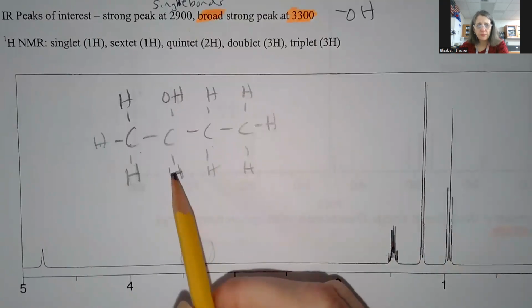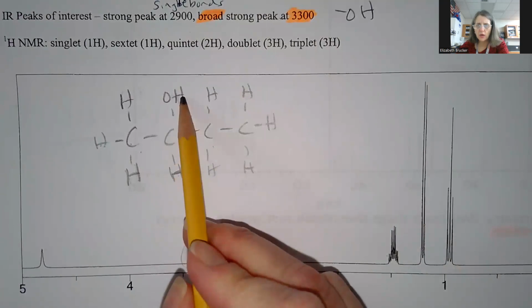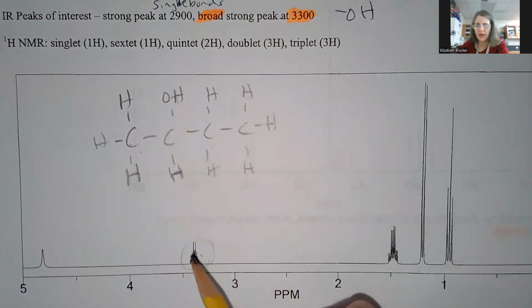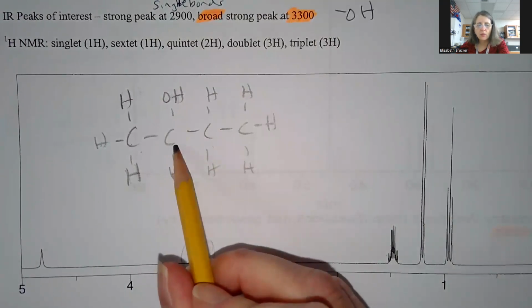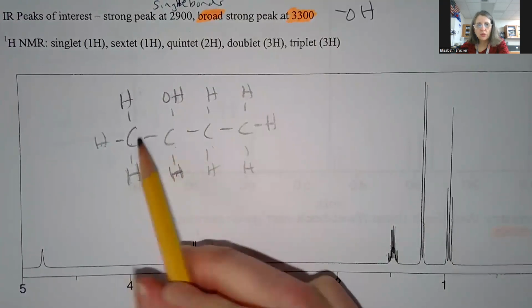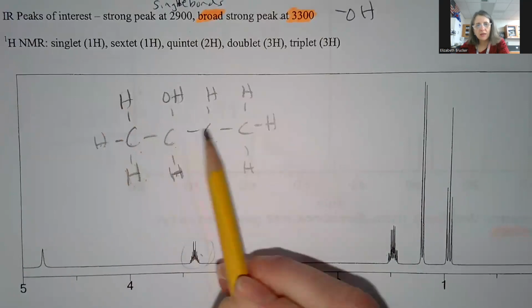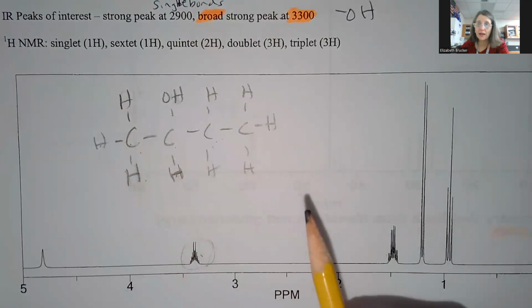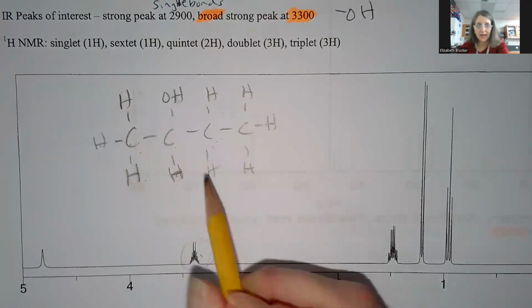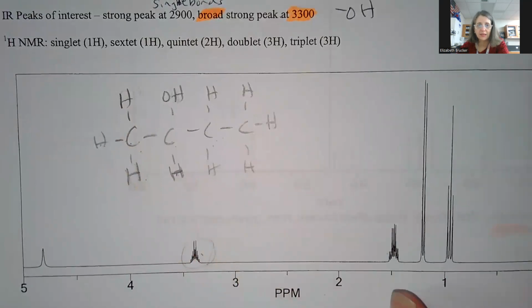Now, again, we are focusing on the hydrogen that's on the carbon that has the OH, because I know this has to be that hydrogen. So if I draw it this way, I'm going to be this hydrogen, okay? I want to look at my neighbors. Well, I now have 2 different neighbors. I have a neighbor here, which has 3 hydrogens on it, and then my other next door neighbor has 2. So 2 plus 3 is 5, plus 1 is a sextet. So this looks pretty good.